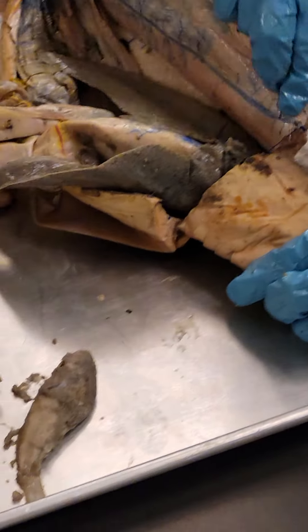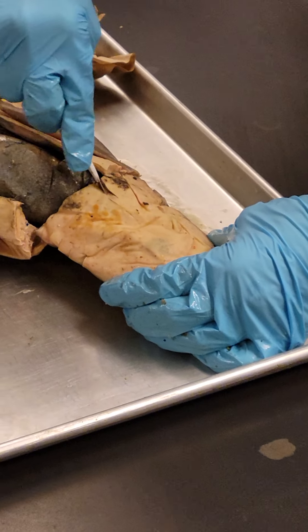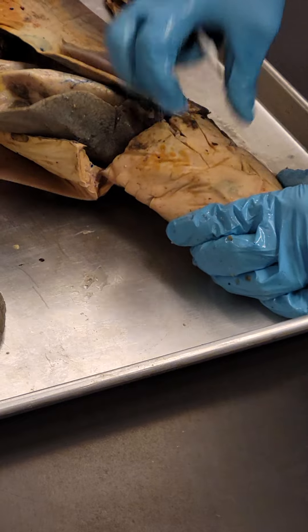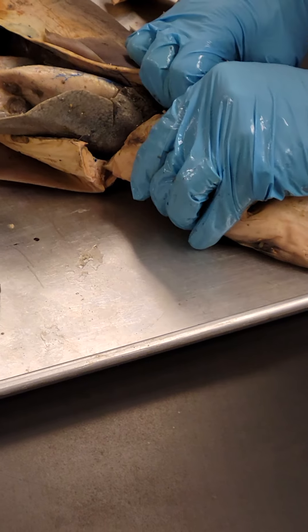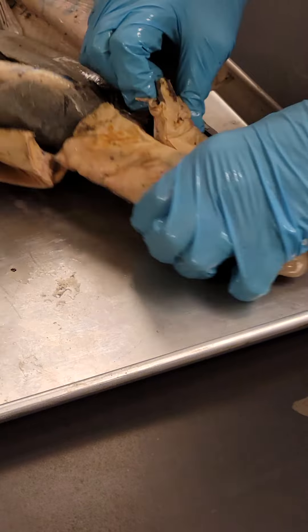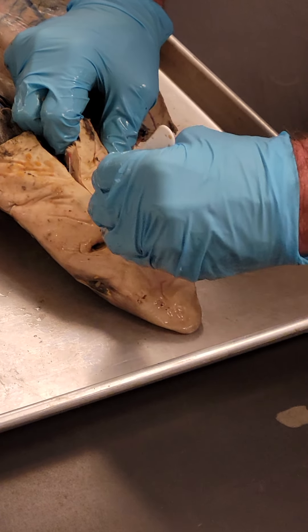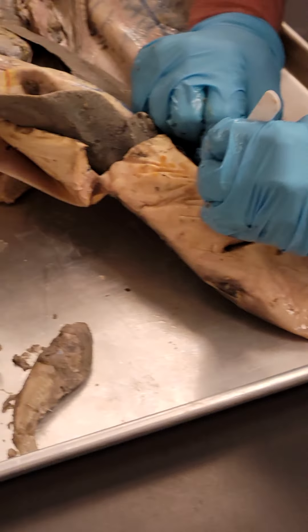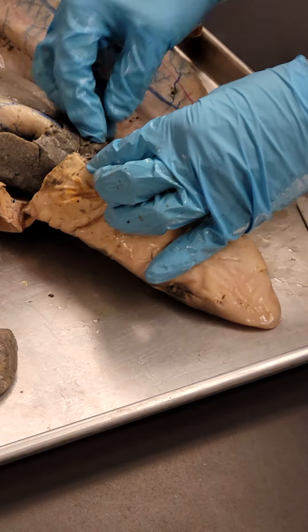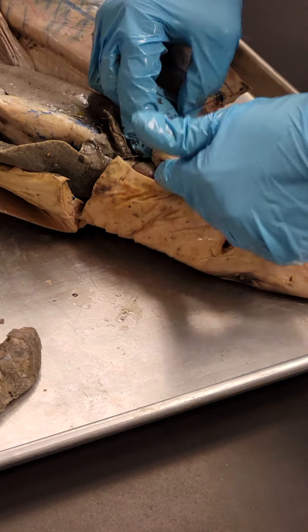Let's go ahead and jump into the cardiac cavity. The muscle gets thicker here, so it requires more finagling. I also have to cut through the pectoral girdle — the cartilage that connects the pectoral fins is right there. Here is our transverse septum.